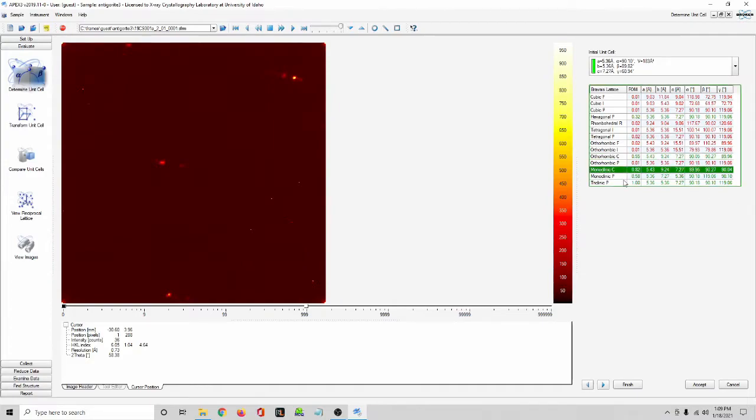We actually know, though, that this is monoclinic C because there's a slight misalignment of the satellite peaks, well, actually of the sublattice. And even though it kind of shows it here, that doesn't mean that it's not hexagonal, these values not being 90, 90, 120. But that would become apparent later on.